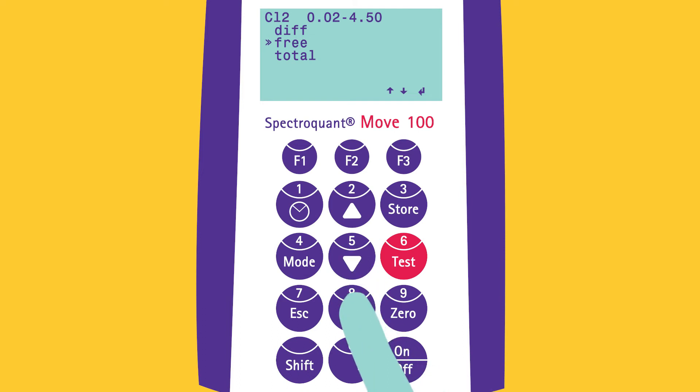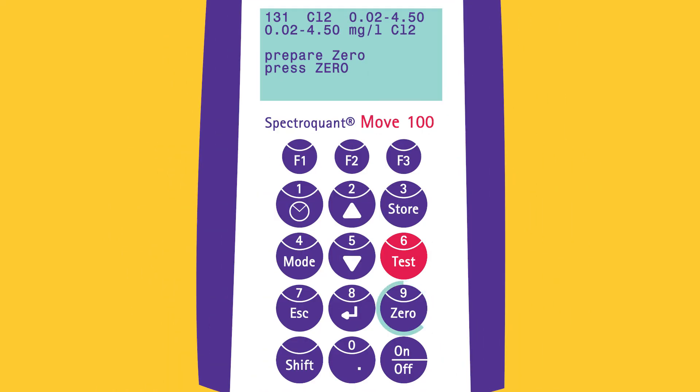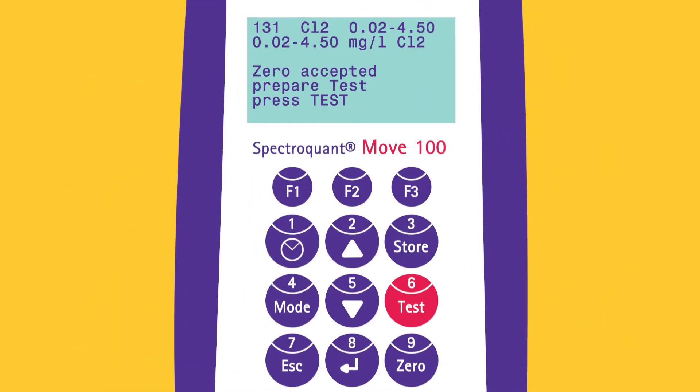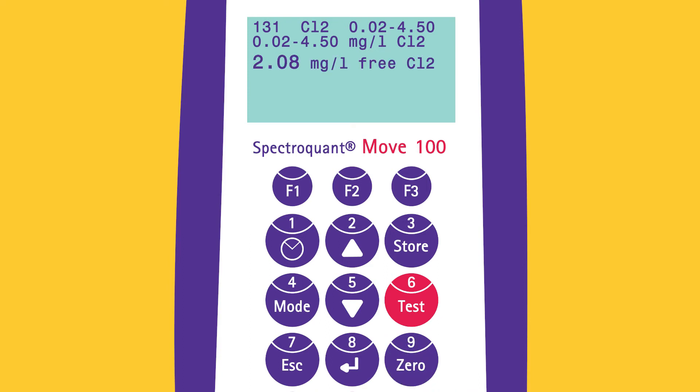After the method has been chosen and after the countdown for the reaction time has passed, a zero adjustment is carried out by placing the appropriate blank sample in the compartment and pressing zero. After the sample has been prepared according to the manual, the cell is placed in the cell compartment. The cell contains an ambient light protector, so the measurement can be carried out in any condition. To start measurement, press TEST. The result appears on the screen.